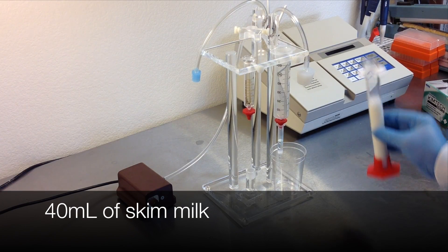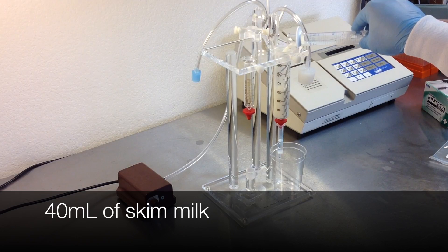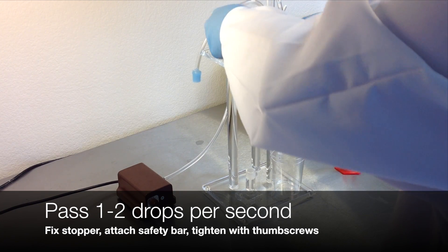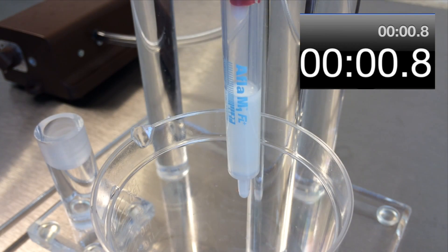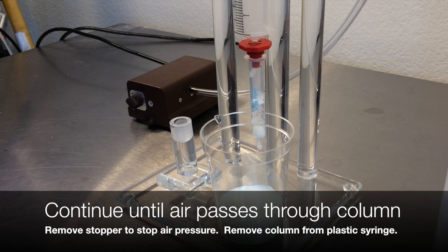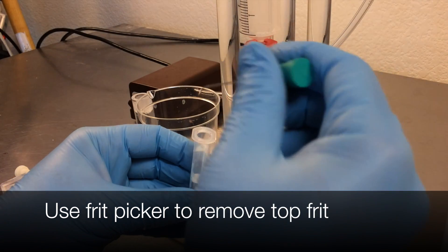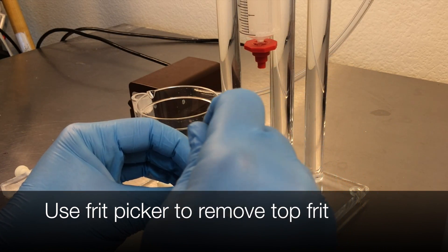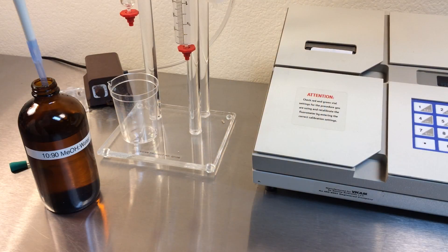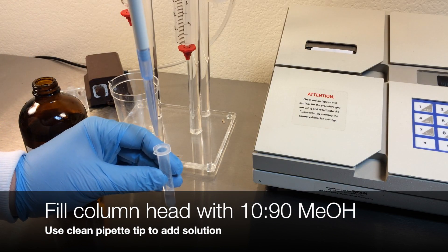Attach the column to the plastic syringe. Add 40 milliliters of skim milk to the plastic syringe, then pass one to two drops per second through the column by applying pressure with the pump. Continue until air passes through the column, then remove the safety bar and the stopper to remove the pressure. Remove the column from the plastic syringe barrel. Remove the top frit from the column using the frit picker. Fill the column headspace with 10-90 methanol water solution.